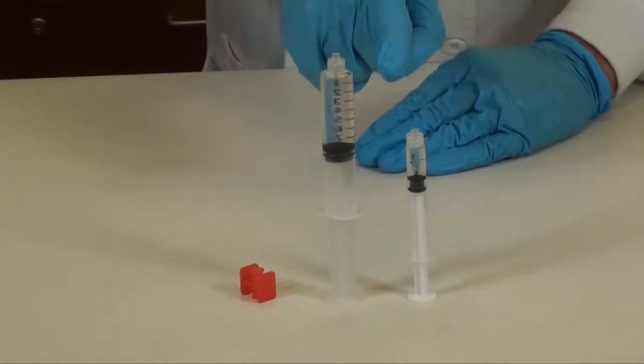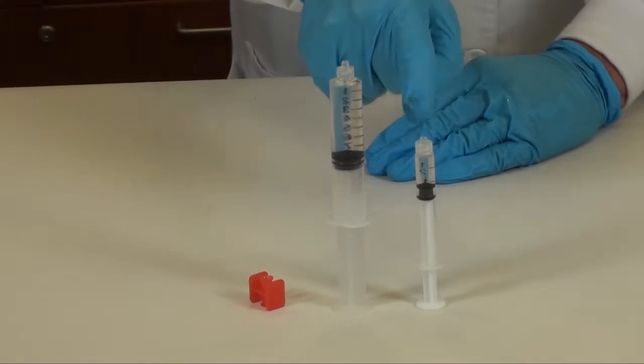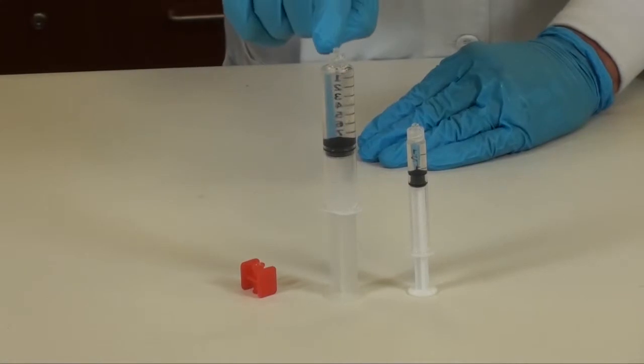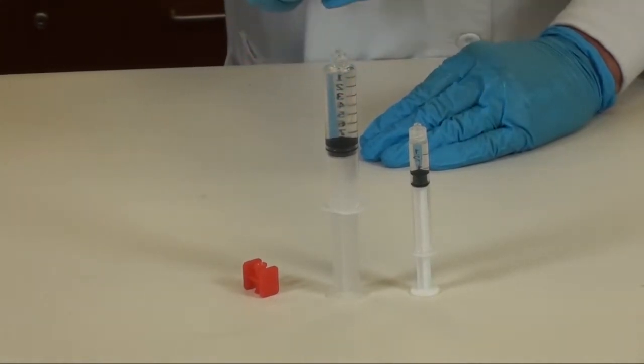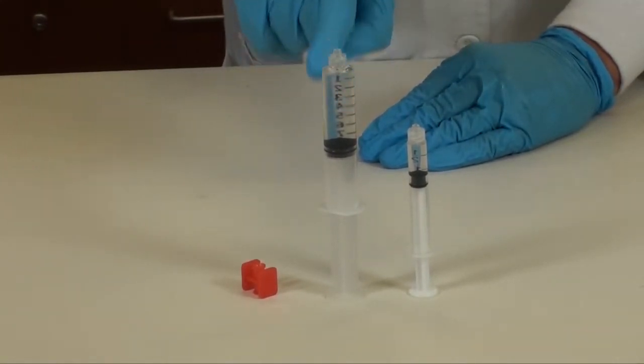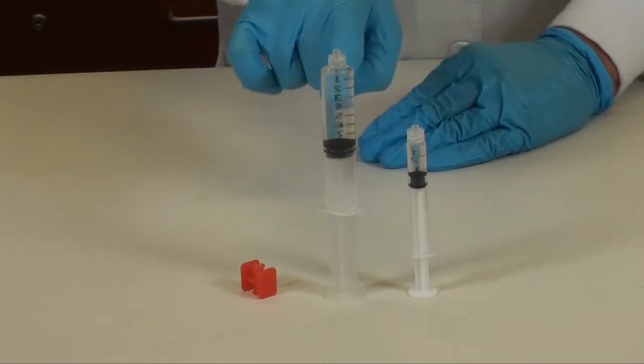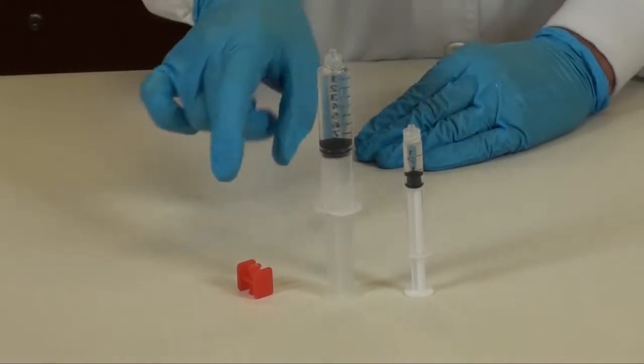As a reminder, in the 3ml syringe we have our acyclovir lidocaine solution which are our active ingredients. And in the 12ml syringe we have our poloxamer solution. And this is the aqueous phase. We want to go ahead and add the 3ml syringe into the 12ml.